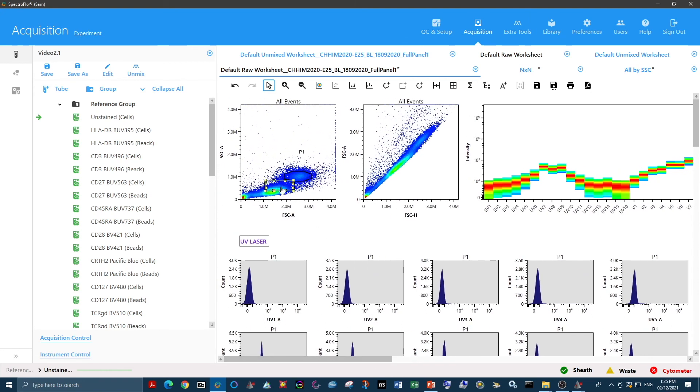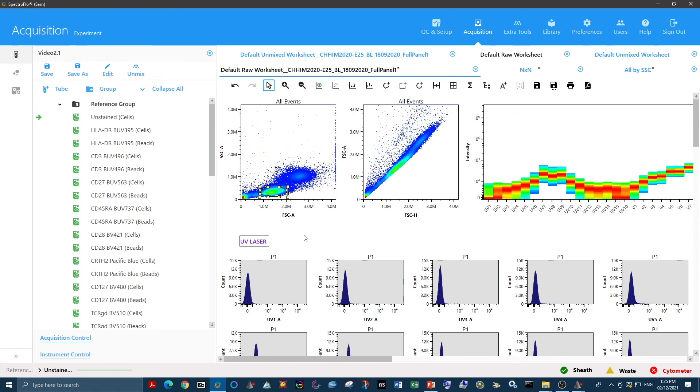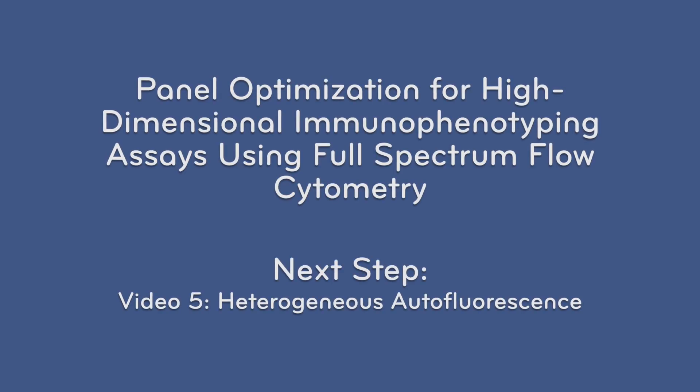But as in this panel we're only looking at lymphocytes, we would only ever set the gate on lymphocytes.